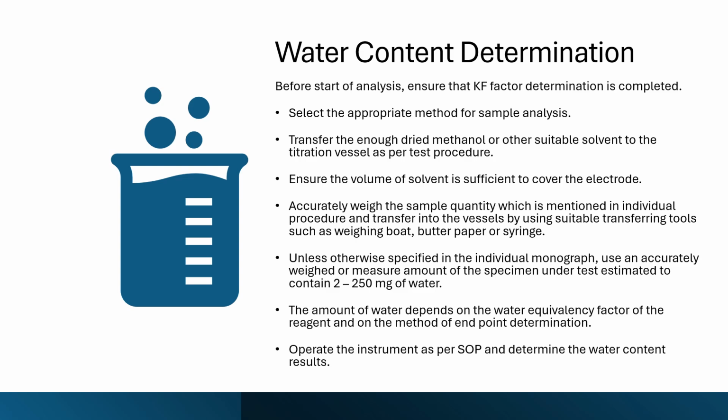Then finally, operate the instrument as per SOP and determine the water content results. So this is what I have explained based on the Metrohm KF titrator and the Tiamo software, which is compatible with this Metrohm instrument. So in this way you can determine the water content, right?